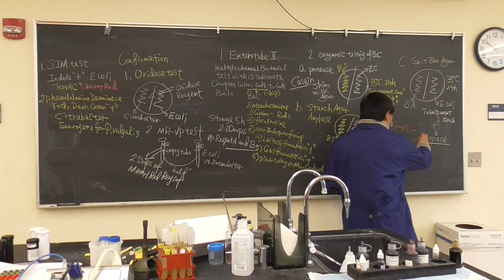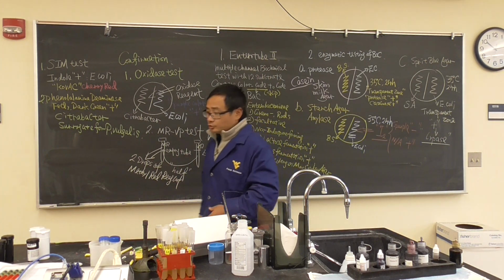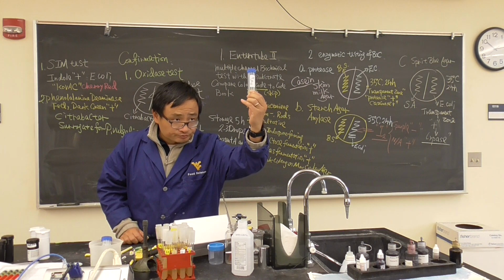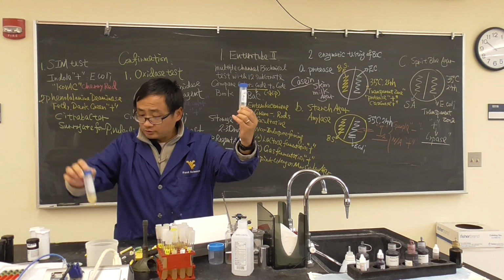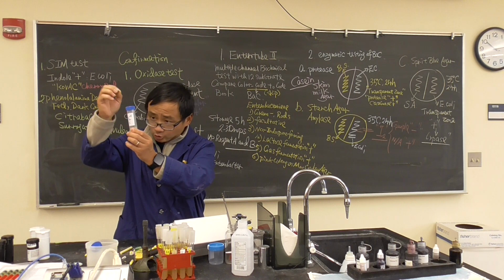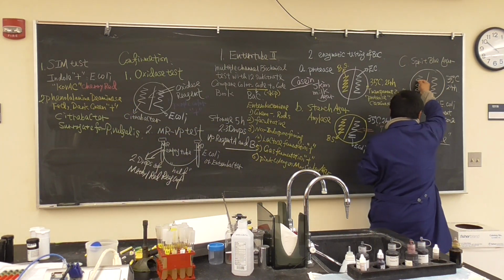Okay? All right, now something I want to say. We don't have Staphylococcus aureus on a slant, so we grow this in my lab. There are 2 tubes. So how do we do it? You have to shake it before you do. Use a loop, pick some of the liquid, then you streak it.